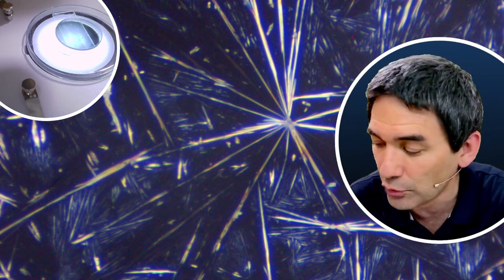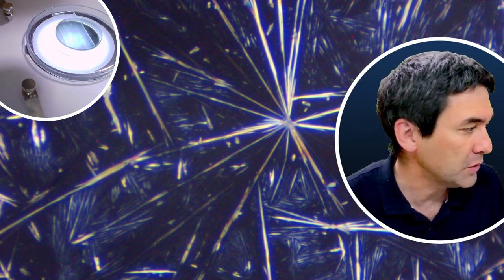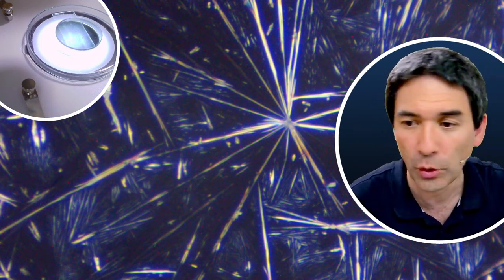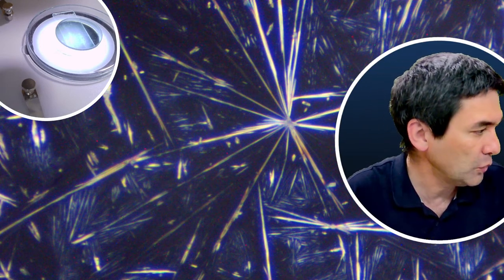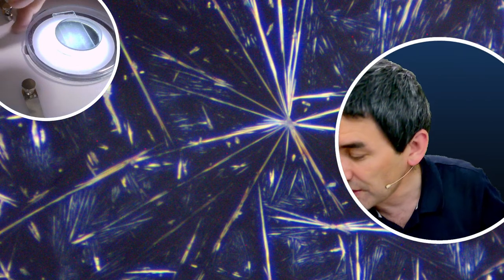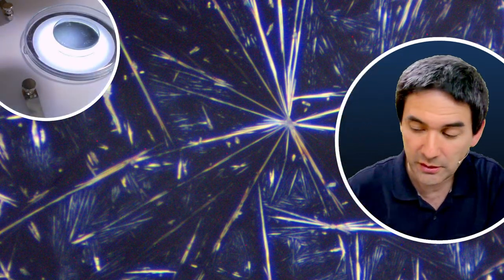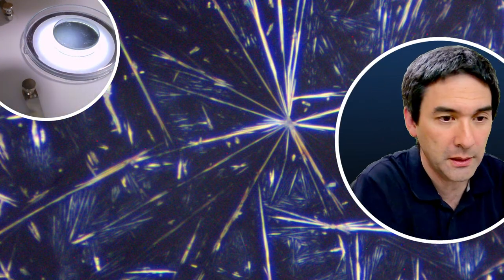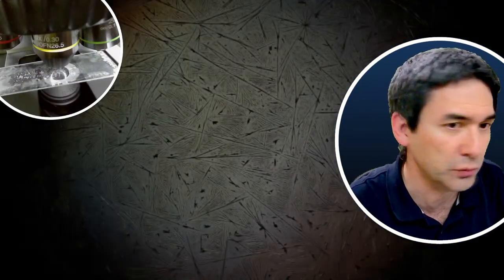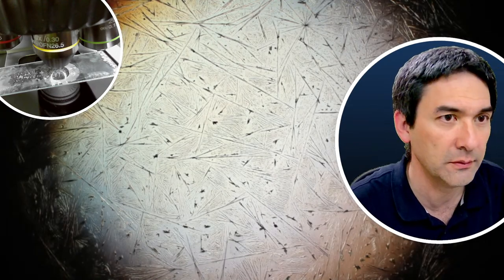It's a nice thing to try out. I'm going to show it to you now in my compound microscope because I do have polarized light also on my compound microscope, obviously. For this reason, I'm going to try it there as well. And you're going to see that it does look nicer because, of course, we have a higher, better resolution. But there is a limitation that I have here.